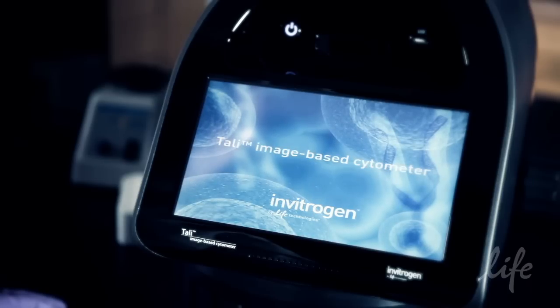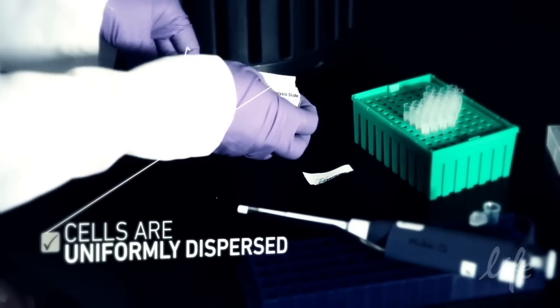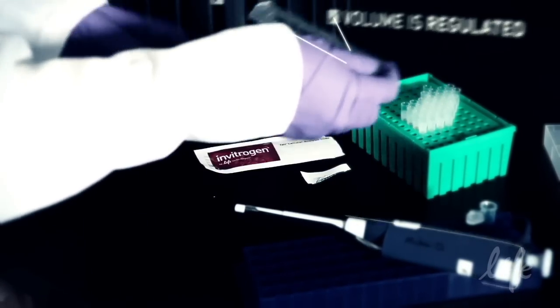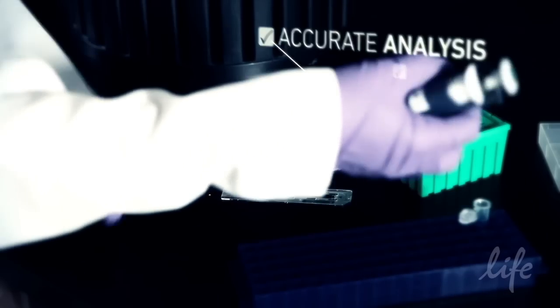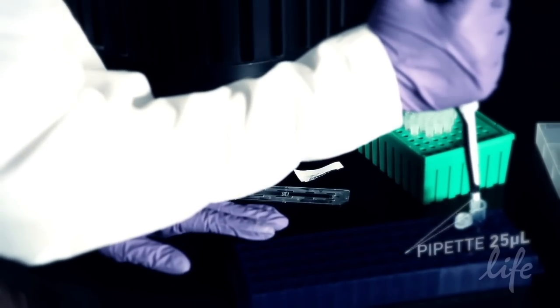The TALI cellular analysis slides are uniquely coated to help ensure that cells are uniformly dispersed and that sample volume is regulated for accurate analysis. Simply pipette 25 microliters of prepared sample into the slide.